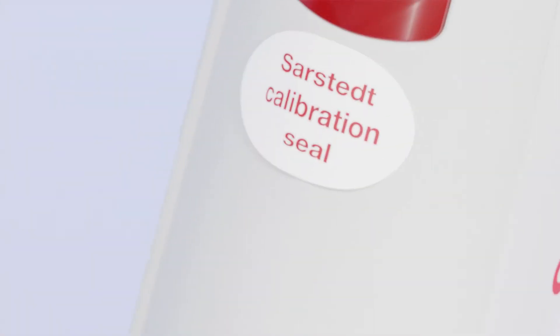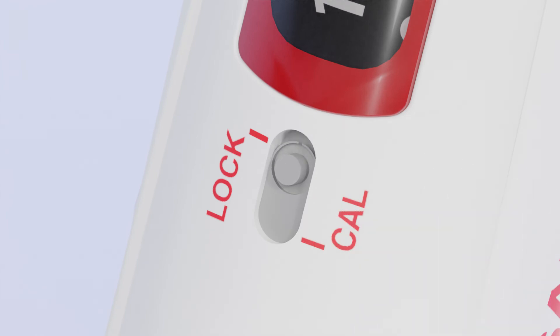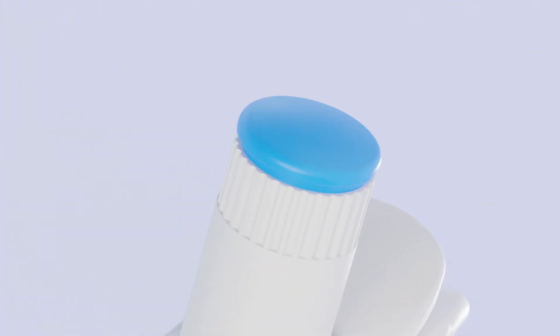You can calibrate your Zarpetta M yourself — quick, secure, and no additional tools needed.